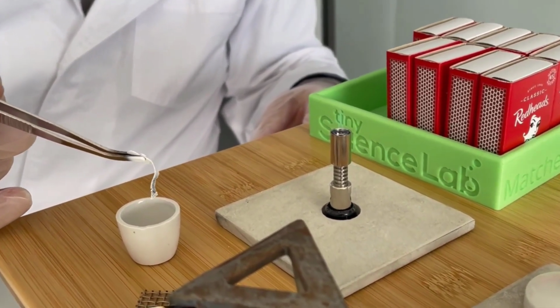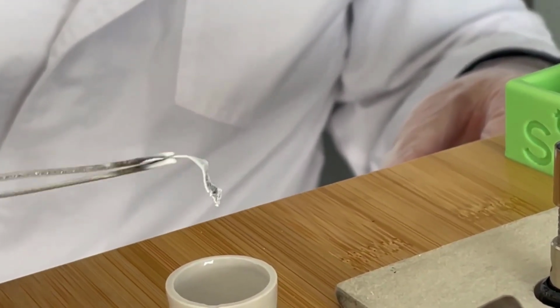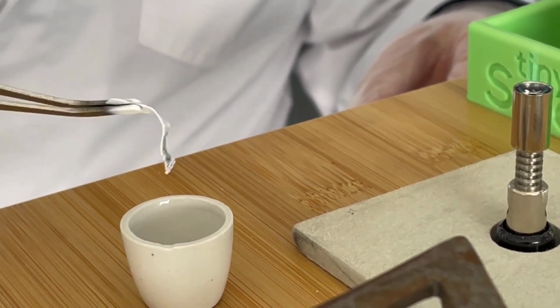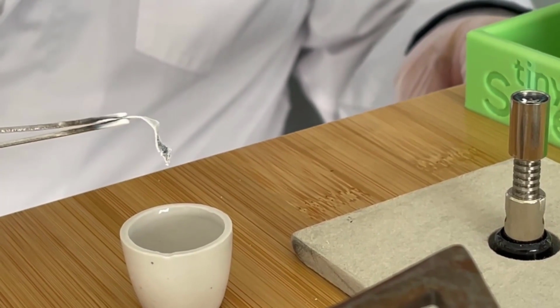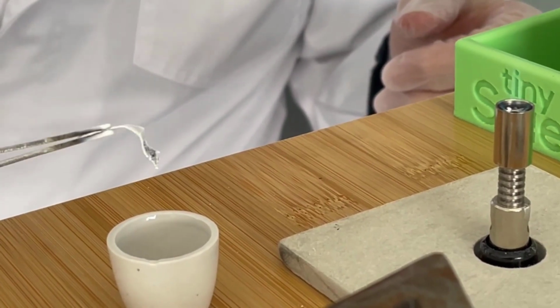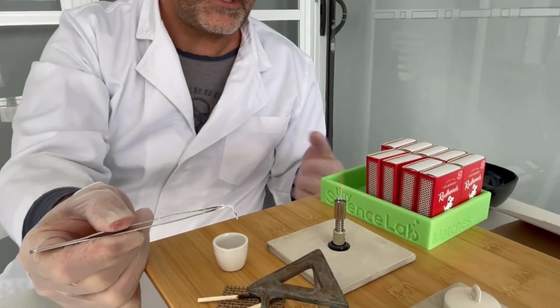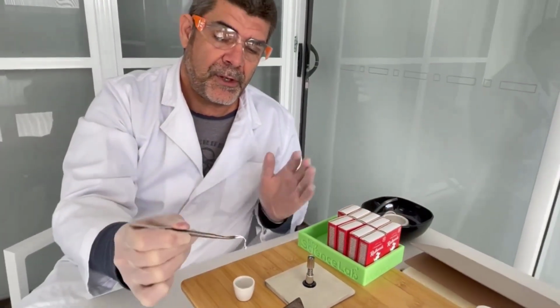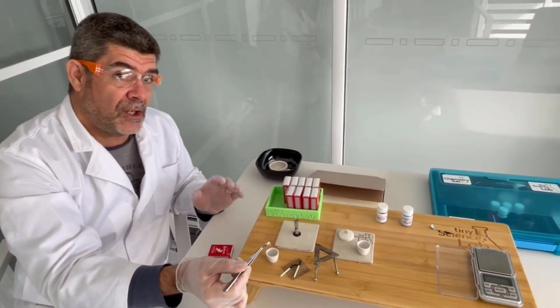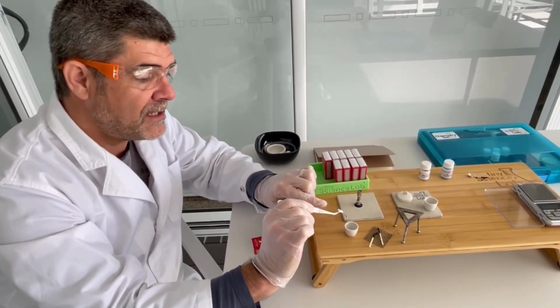You can see the reaction is a rapid reaction. We get this beautiful white powder. This powder is magnesium oxide. You can see that the compound magnesium oxide is very different to the two elements that make up magnesium oxide, the magnesium, the solid metal, and the oxygen from the atmosphere. There's a lot of things that we could talk about in terms of the characteristics and the properties of elements and compounds. But what we want to do today is make it a little bit more mathematical. We want to look at how we can determine exactly how much oxygen has reacted with the magnesium in order to form the magnesium oxide.